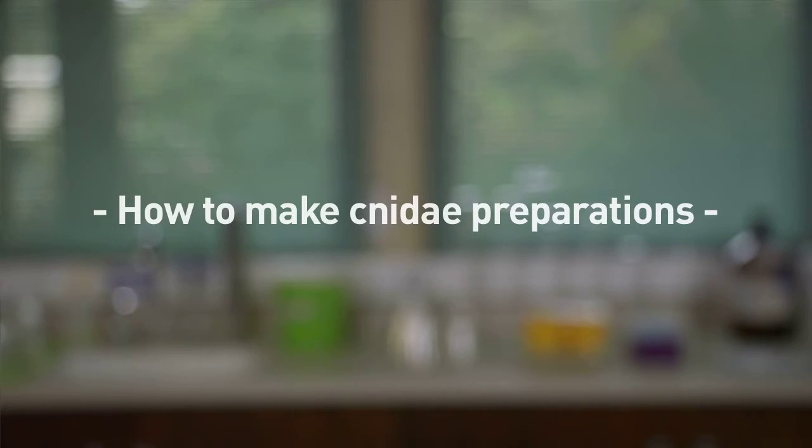The types, the distribution and the size ranges of the cnidae are diagnostic characters for sea anemones. Thus, in order to identify a sea anemone you need to make cnidae preparations. In this video I'm going to show you how to make cnidae preparations.